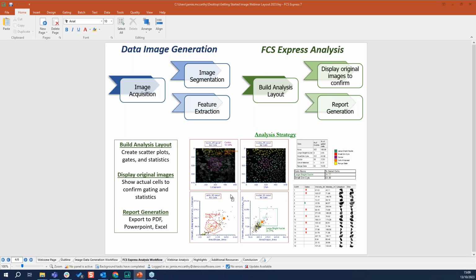So you may have noticed that I'm already presenting to you directly from FCS Express. In this way, I'm trying to show you that you can make these really nice, presentation-ready final results. We're able to use all of these other features to tell a story and to have a nice final result for us.